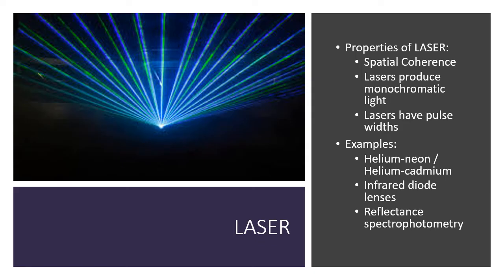Next is laser. Properties of laser, it has spatial coherence. That's the reason why ginagamit siya sa mga nightclubs. No? It's a light show. So when you shine a laser, kung mapapansin nyo, it does not illuminate the surroundings very much. Kasi nga meron siyang spatial coherence. If a laser is fired from here to this point, it's going to draw a straight line. It's not going to spread out like your common light sources. Unlike your flashlight, na kapag gumamit ka ng flashlight from this source, malaki yung range niya talaga.